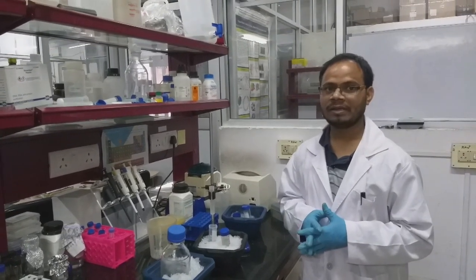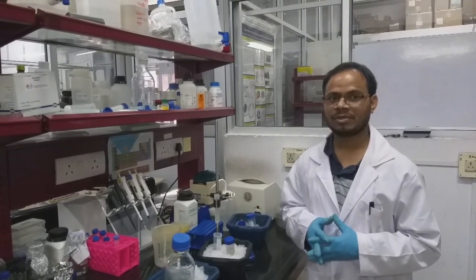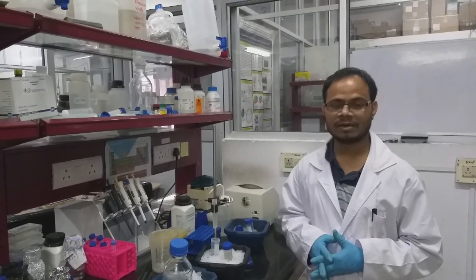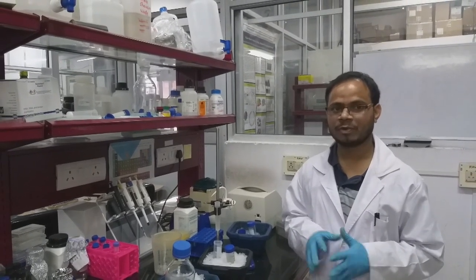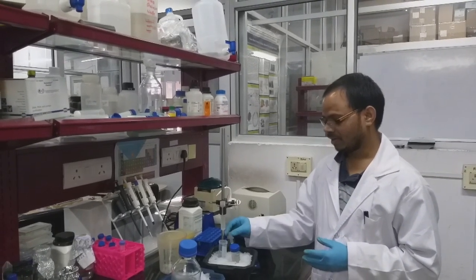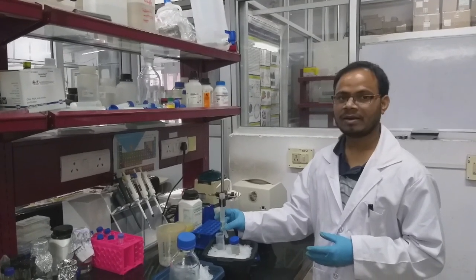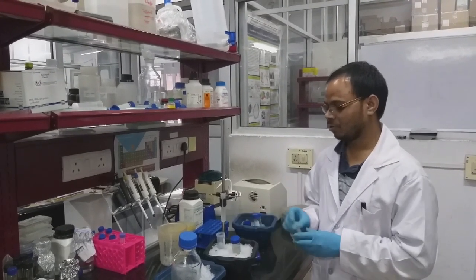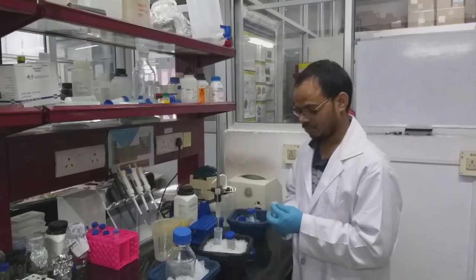Say you are getting only 10% of the protein in your purified fractions and 90% of the protein is eluting in the flow through. In that case you can reuse the flow through for purifying the protein. So you have to collect the fractions in small microcentrifuge tubes, and we have to label them and save them.